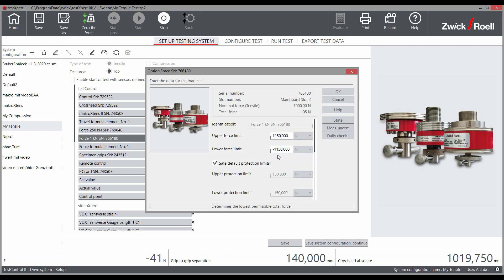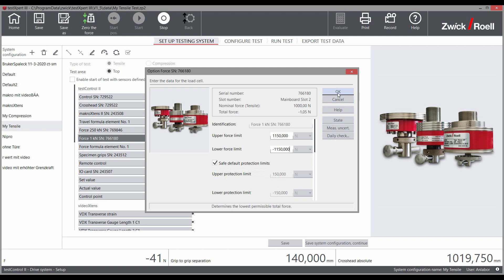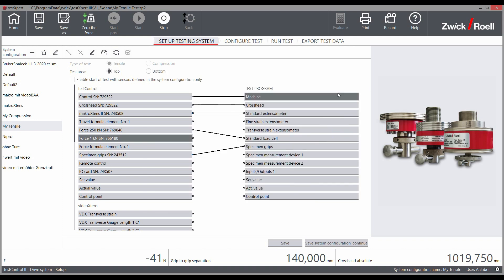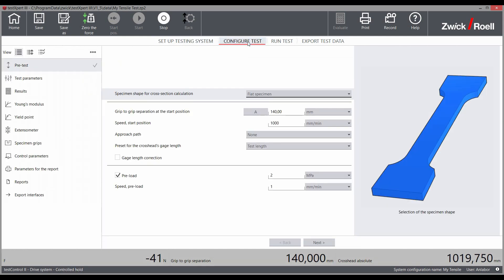When changing the test program, you can confidently set the machine back to the initial position defined for that test type. The associated system configuration is loaded automatically and takes over all settings and monitoring activities.